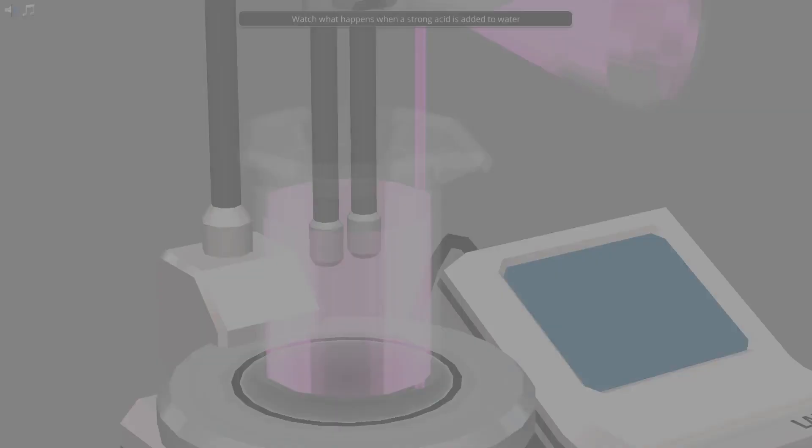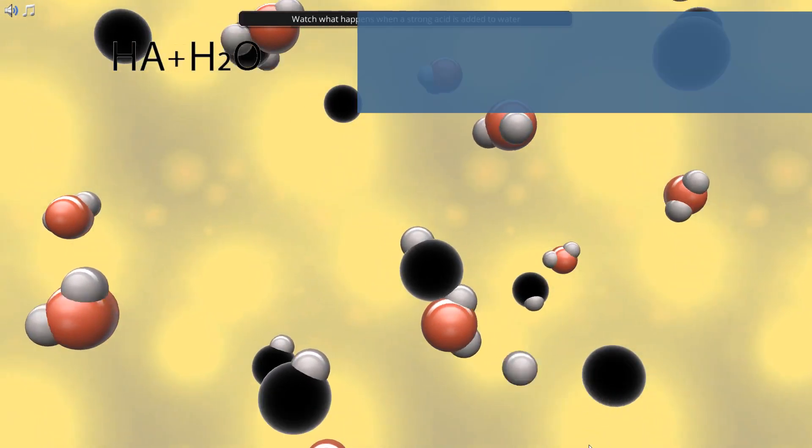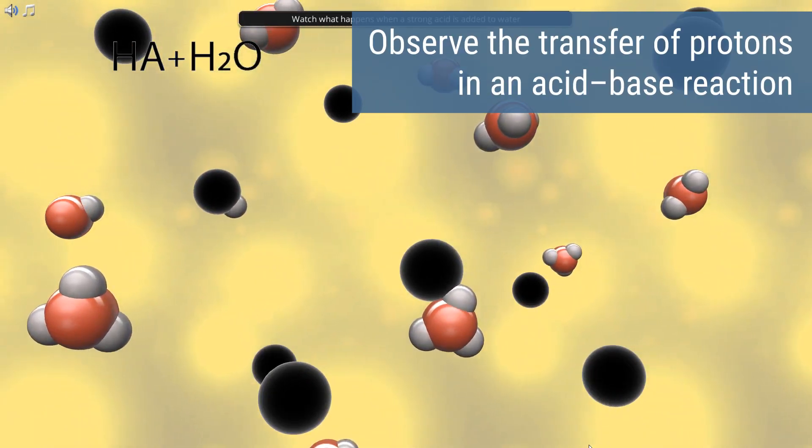Take a close look at the beaker to see how strong acids and bases interact with water molecules and watch the transfer of protons in an acid-base reaction.